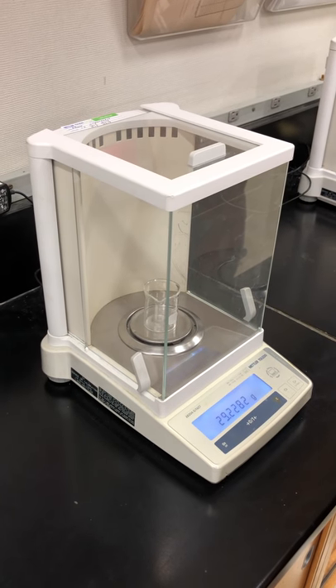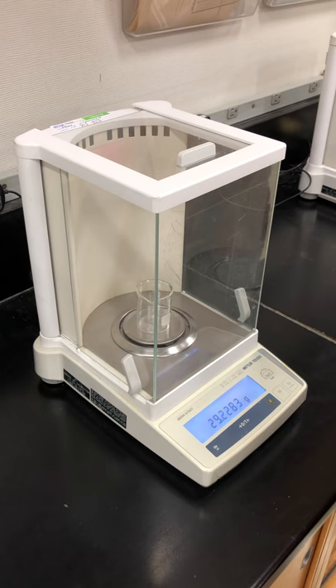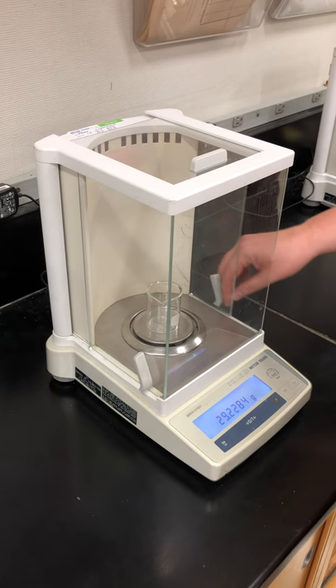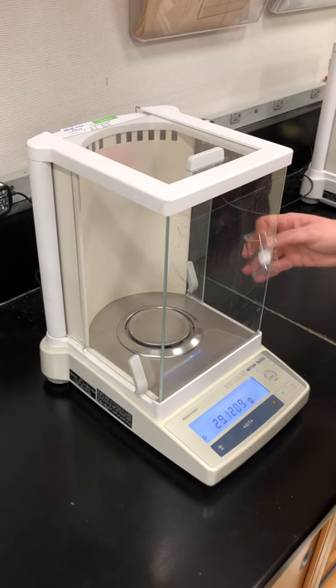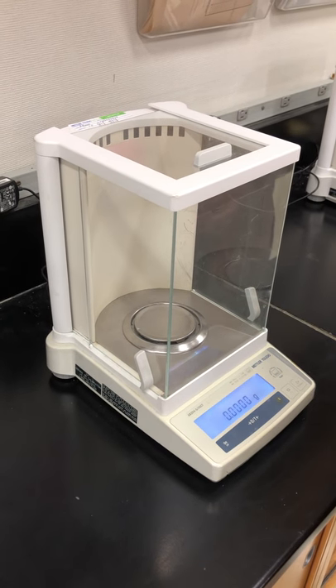The weight of our beaker is 29.2283 grams — record all of those digits. Then open the balance, remove your object, close the balance door, and it's ready for the next person.